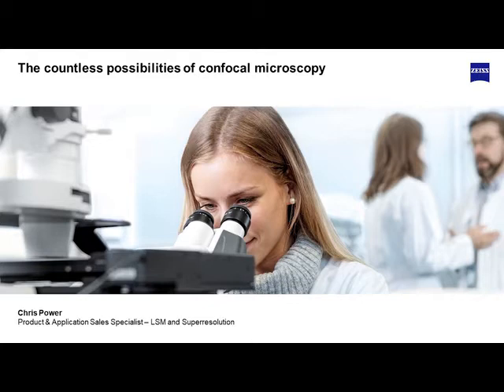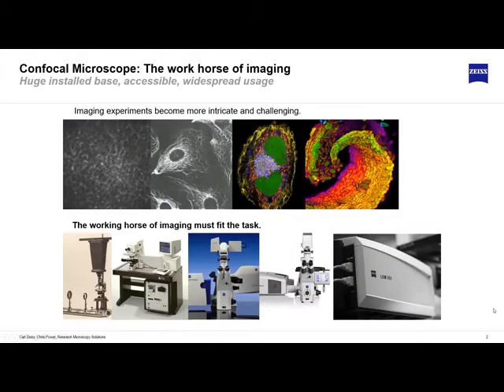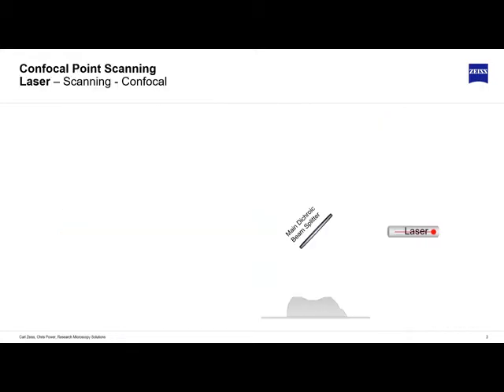So, as I mentioned, the basics of confocal started long ago as a routine imaging system. And over time, these have become more and more powerful. To start any talk on confocal, I will briefly explain laser scanning confocal for those of you who aren't familiar.